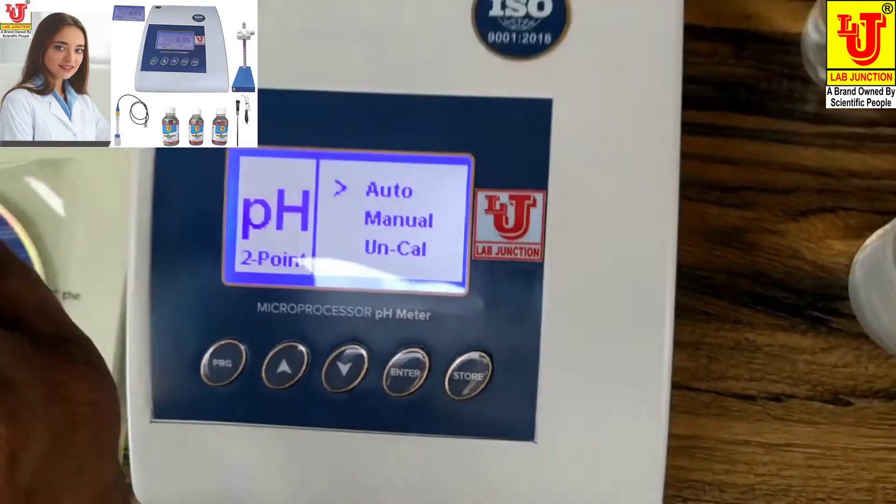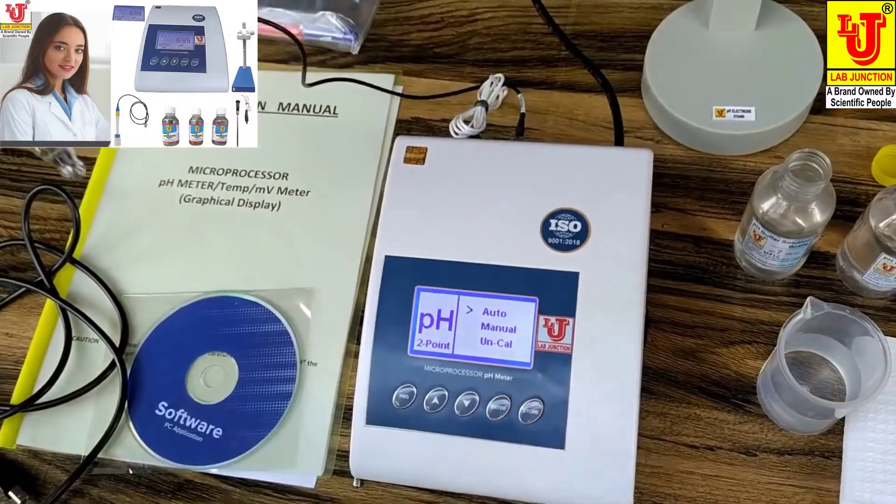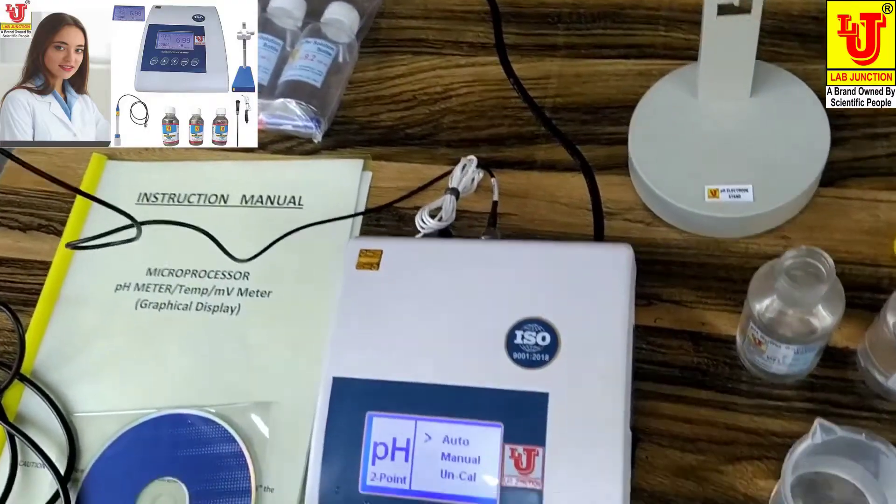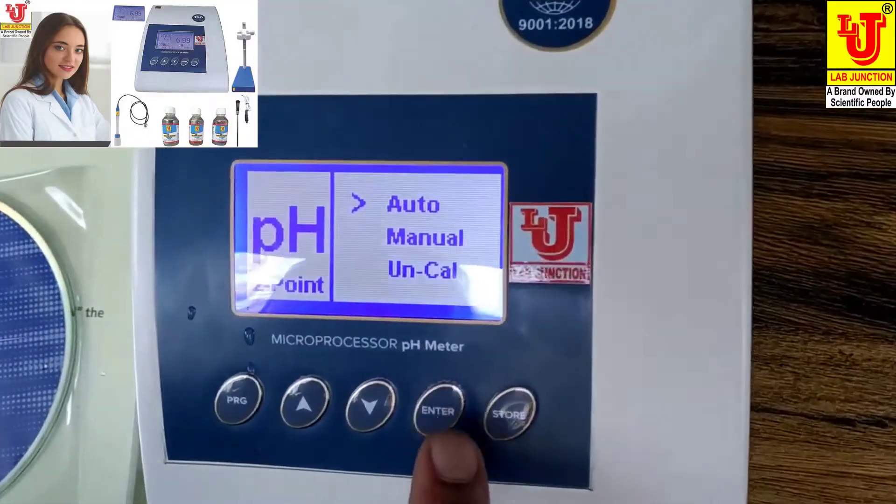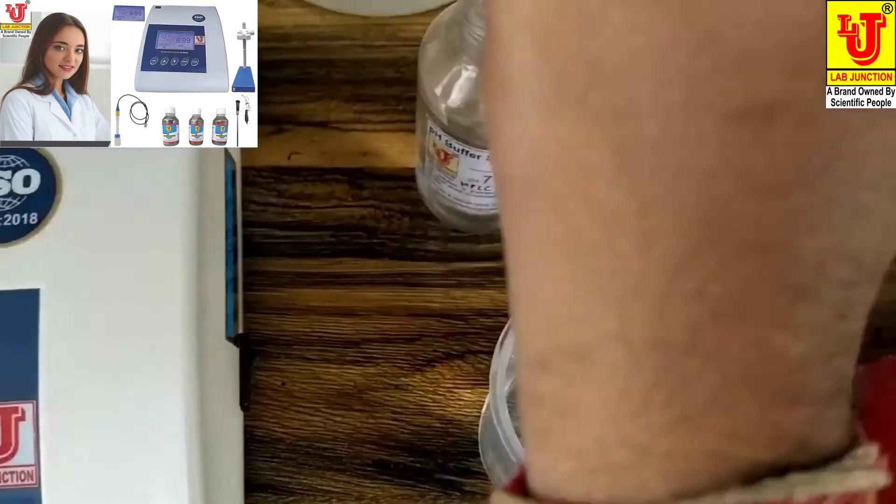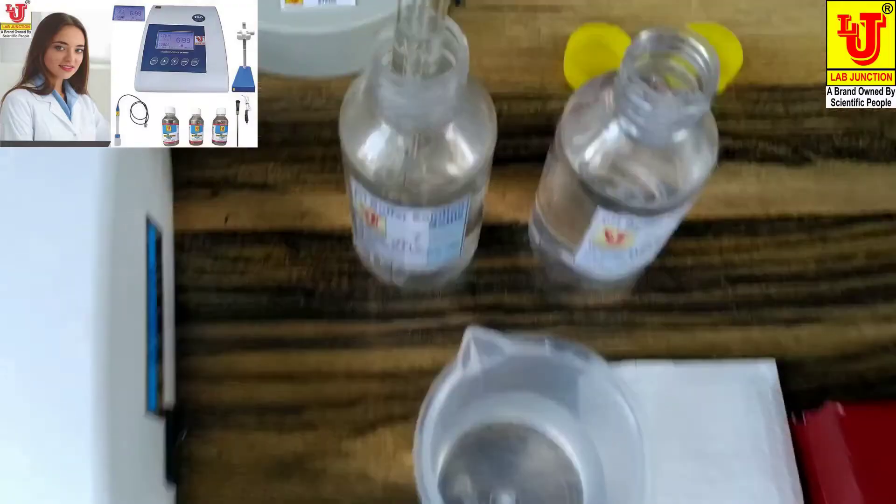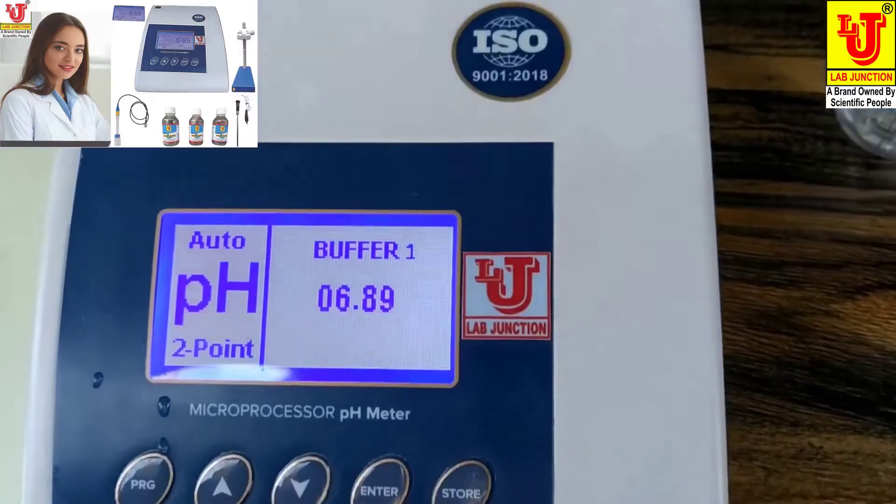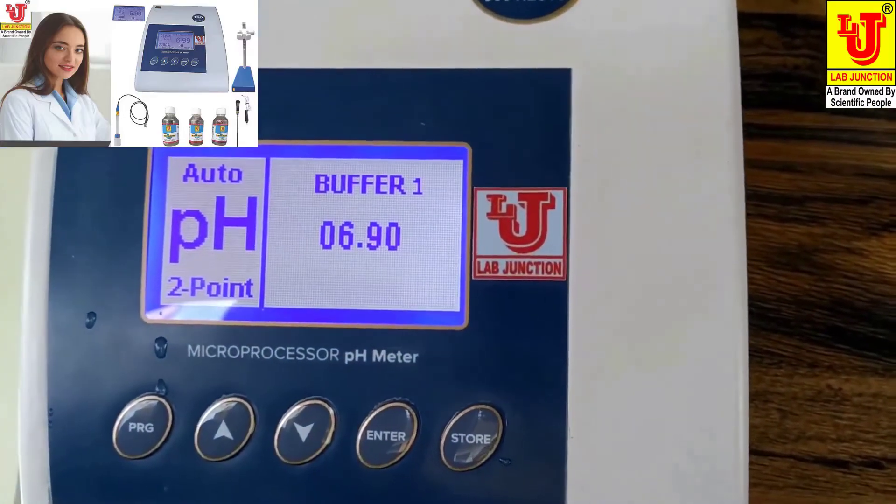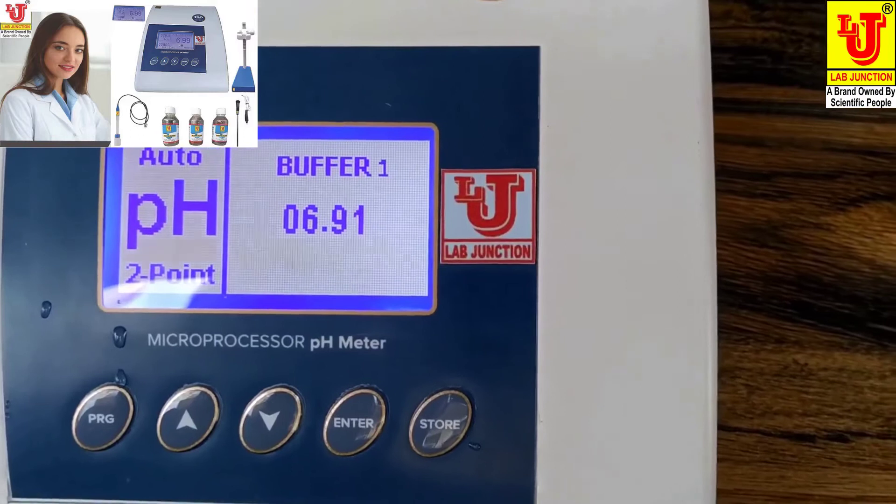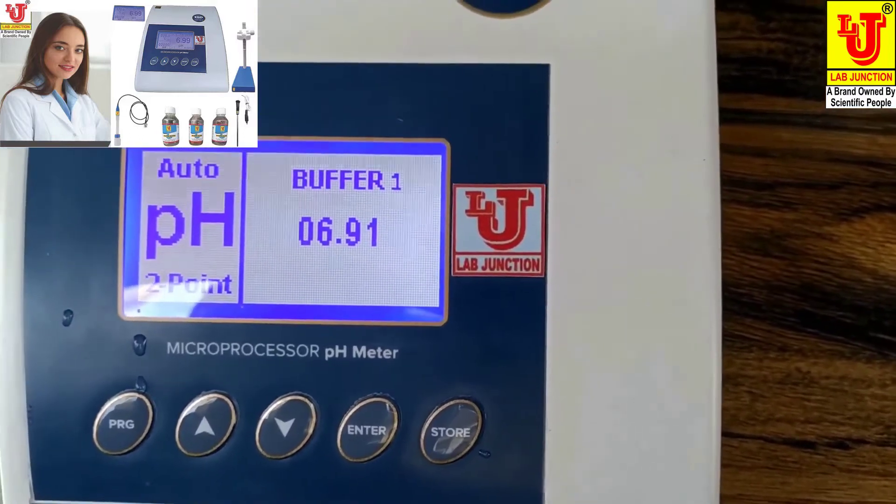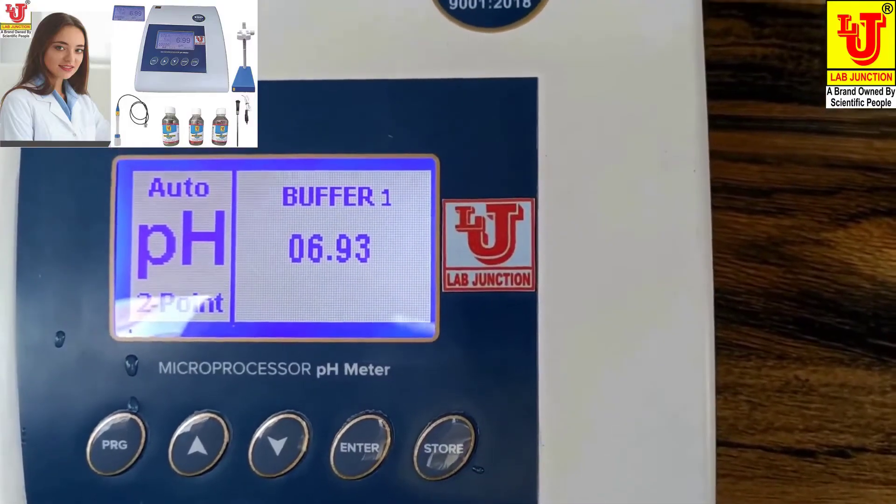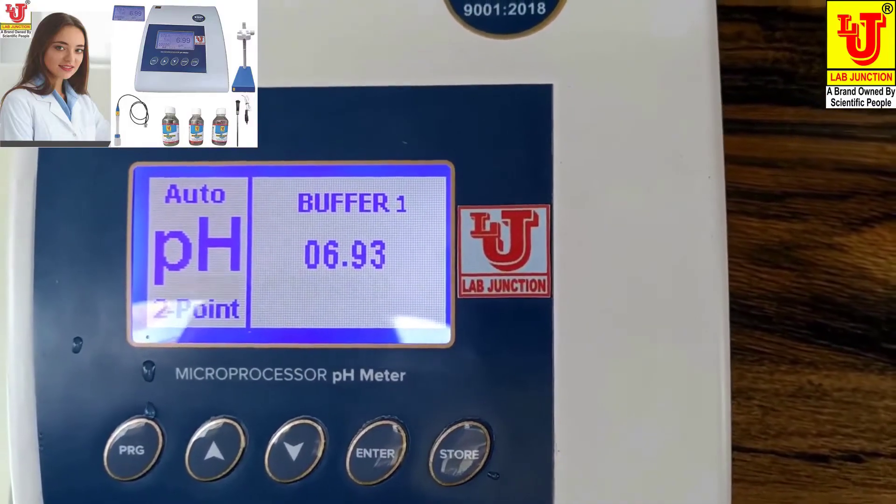This is your temperature pH electrode. If you want to calibrate on auto mode, you can dip the pH electrode to pH 7 buffer bottle and press enter. It can recognize automatically. Now give some time to achieve buffer solution at its final position.